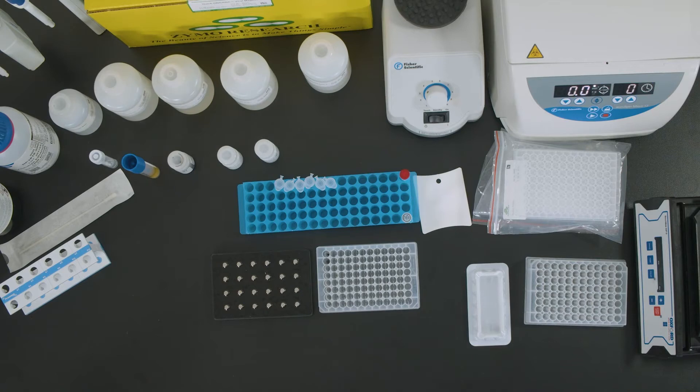In this video, we will show you how to perform nucleic acid extraction using the Zymo Research Magnetic Bead Extraction Kit for the 96-well format, catalog number R2140.